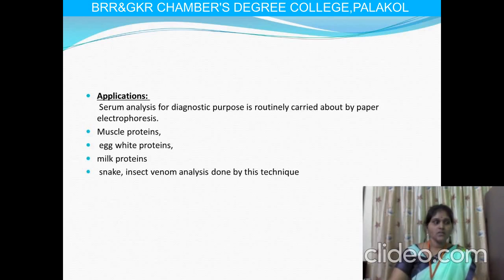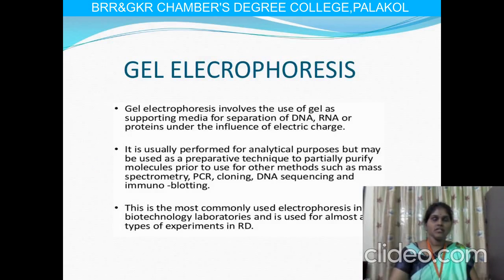venoms also. So the next, it is also used for the separation of polysaccharides, and for different types of estimations like aminopeptidases and amino derivatives. The next topic is gel electrophoresis.